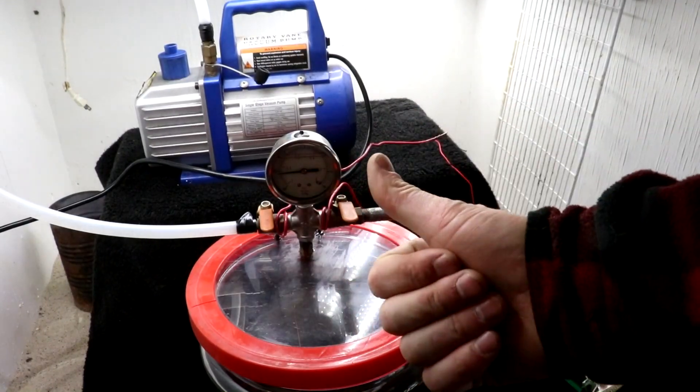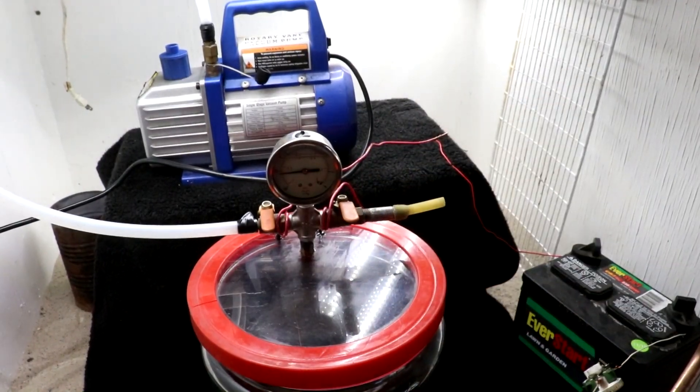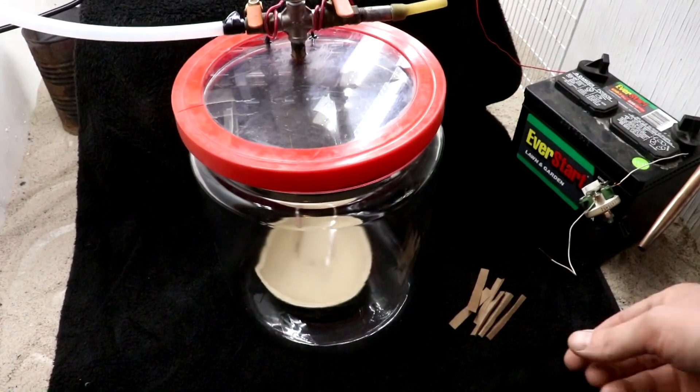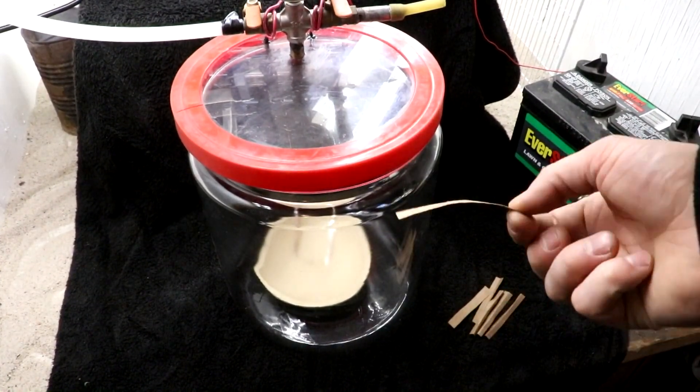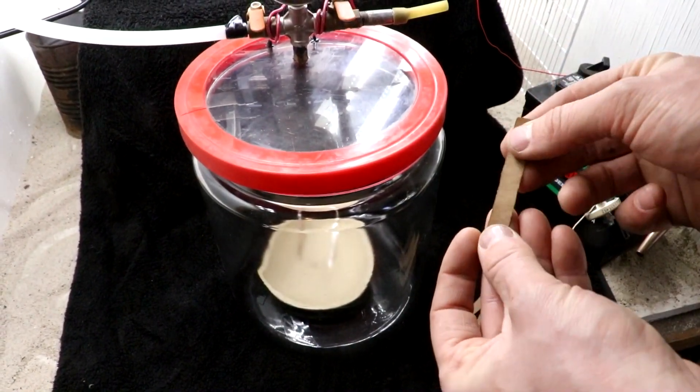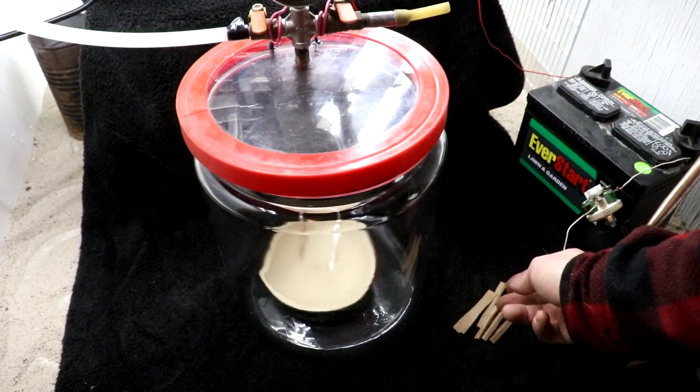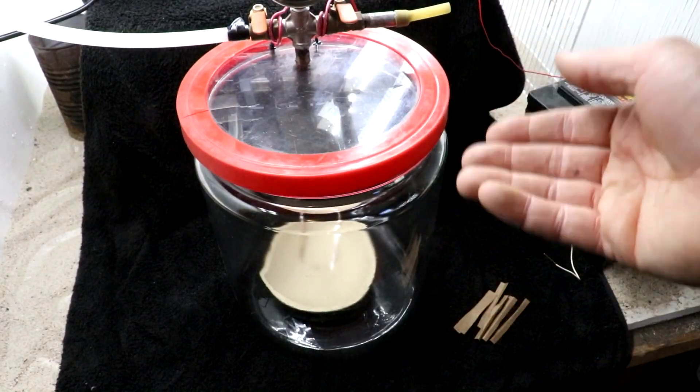All right everyone, welcome back to Cody's Lab. In today's video, the goal is to burn some bits of paper. These are 100 milligram strips of brown paper bag in an atmosphere of pure oxygen, but at reduced pressure.